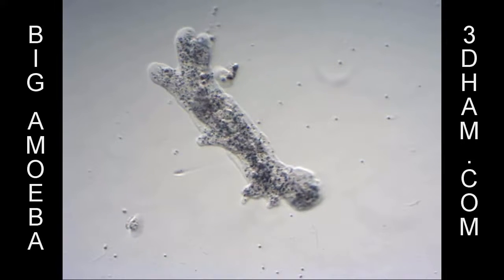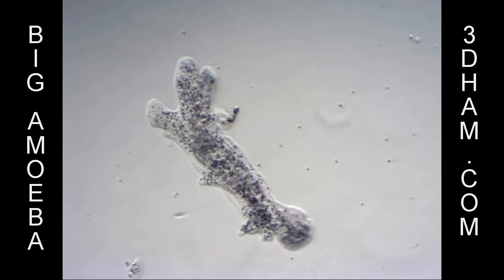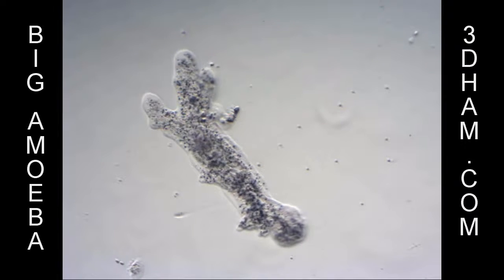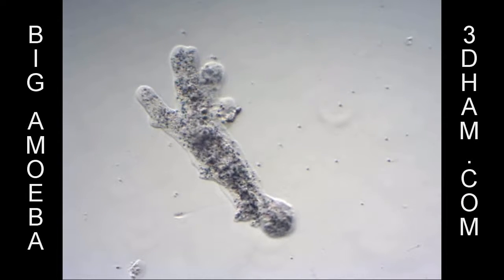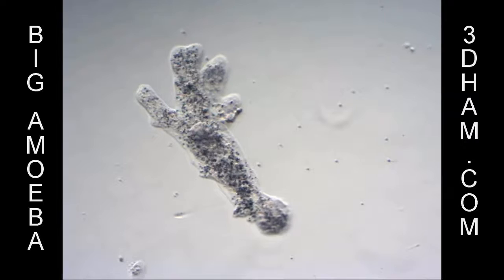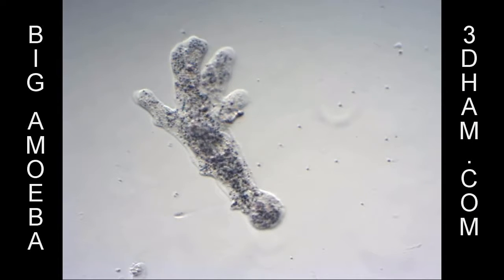This is because there is a larger amount of particulate matter which amoeba thrive on. If you want to actually observe this process, you will usually have to spend several hours watching an amoeba before you finally catch one dividing in two.